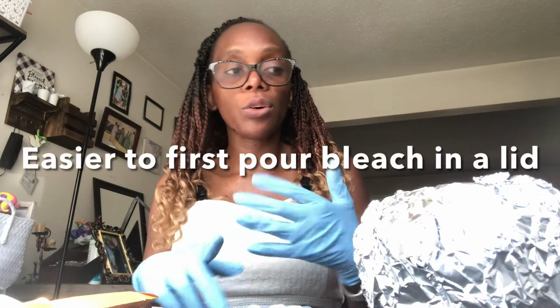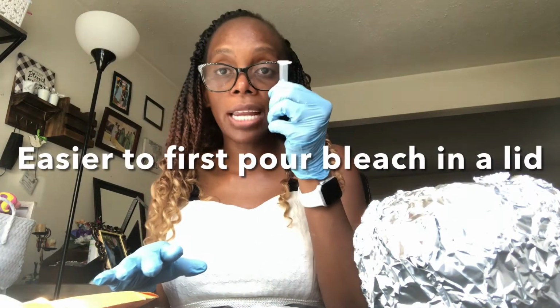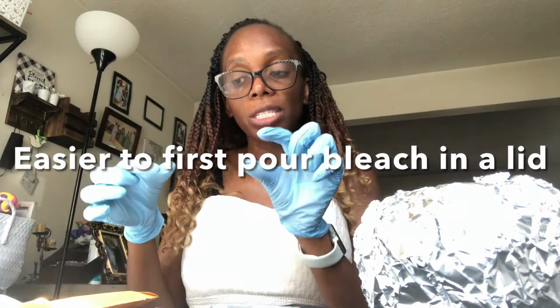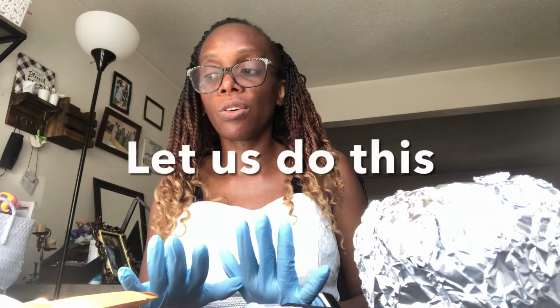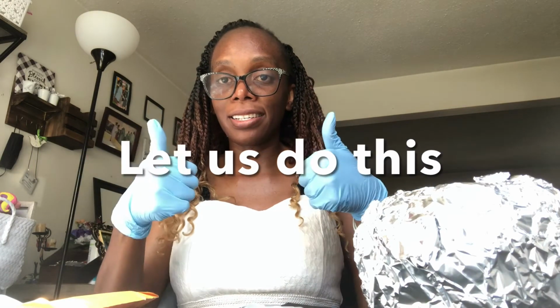And yeah, so I have mine. So the easiest thing to do is, because you only need a little to add in one of these tubes, get your household bleach, put it on a lid or a small Tupperware, then it's easy to pour it in one of these tubes. Okay, so let's get started and let's do this.